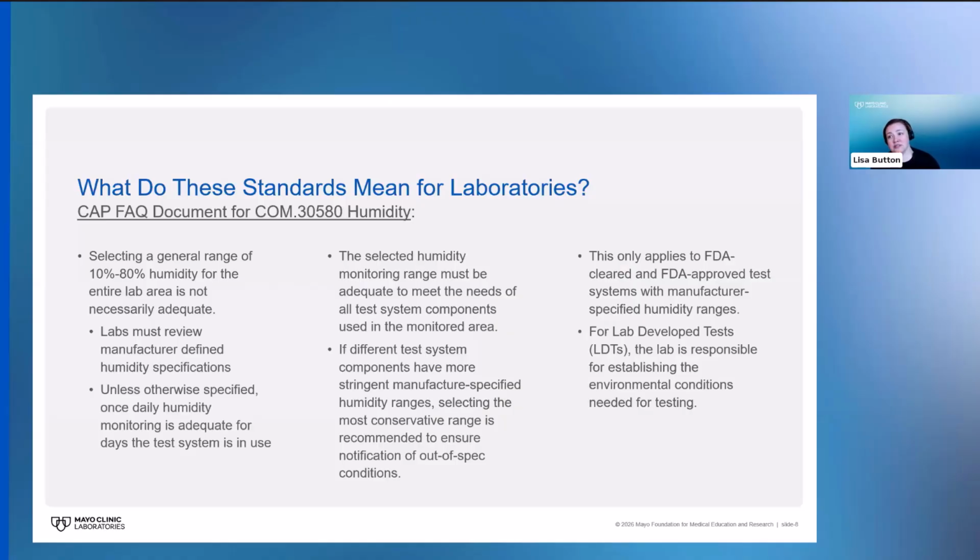All right, so what do these standards mean for laboratories? CAP has an FAQ document out on their website. So if you are a CAP accredited institution, you're able to get into their eLab Solutions suite, and you'll be able to search for this particular FAQ document. My laboratories found it really helpful for them as we were trying to interpret what CAP might be asking for or expecting to see when they come to inspect on this new standard. So I pulled out some of the high points from this FAQ document.